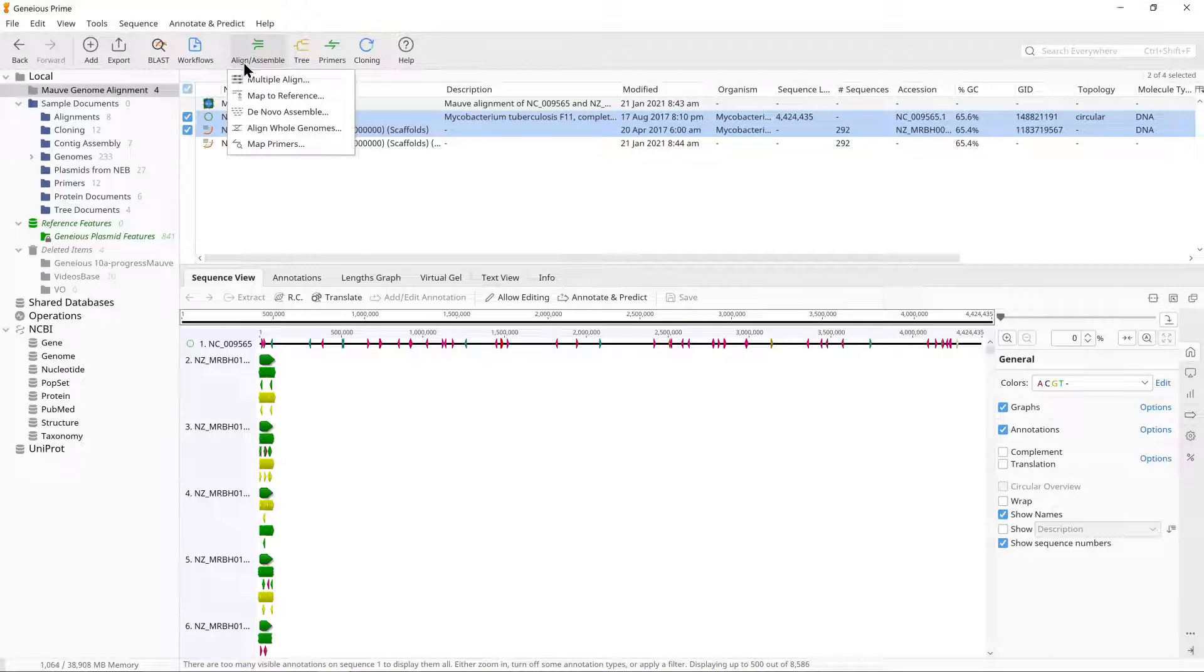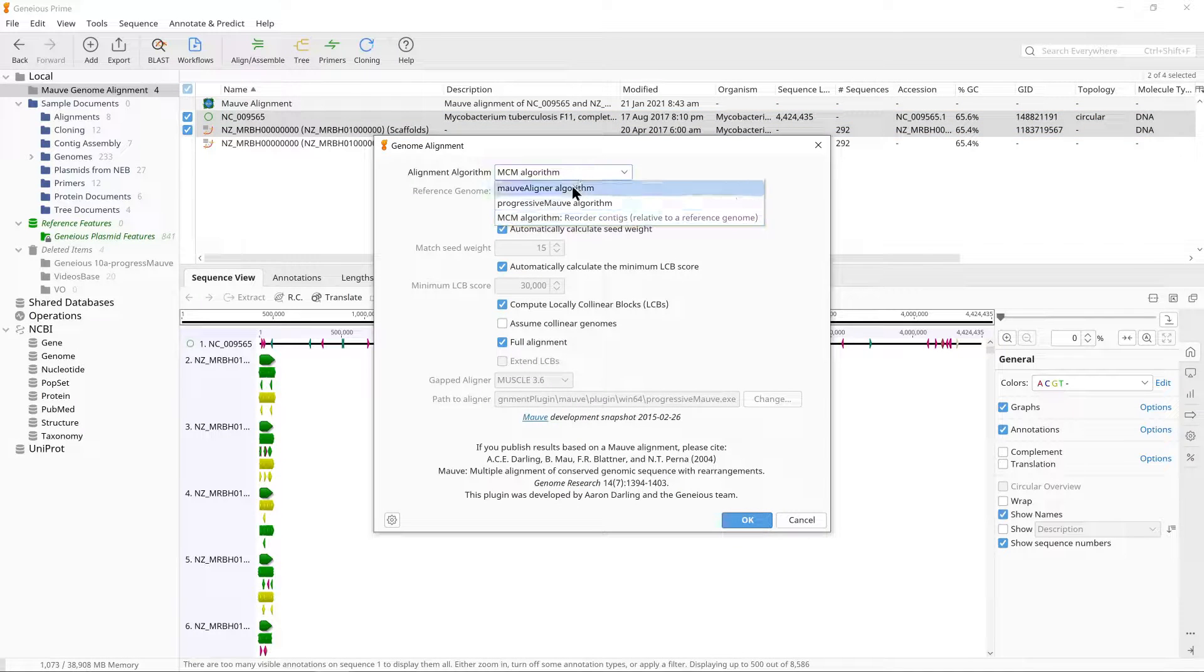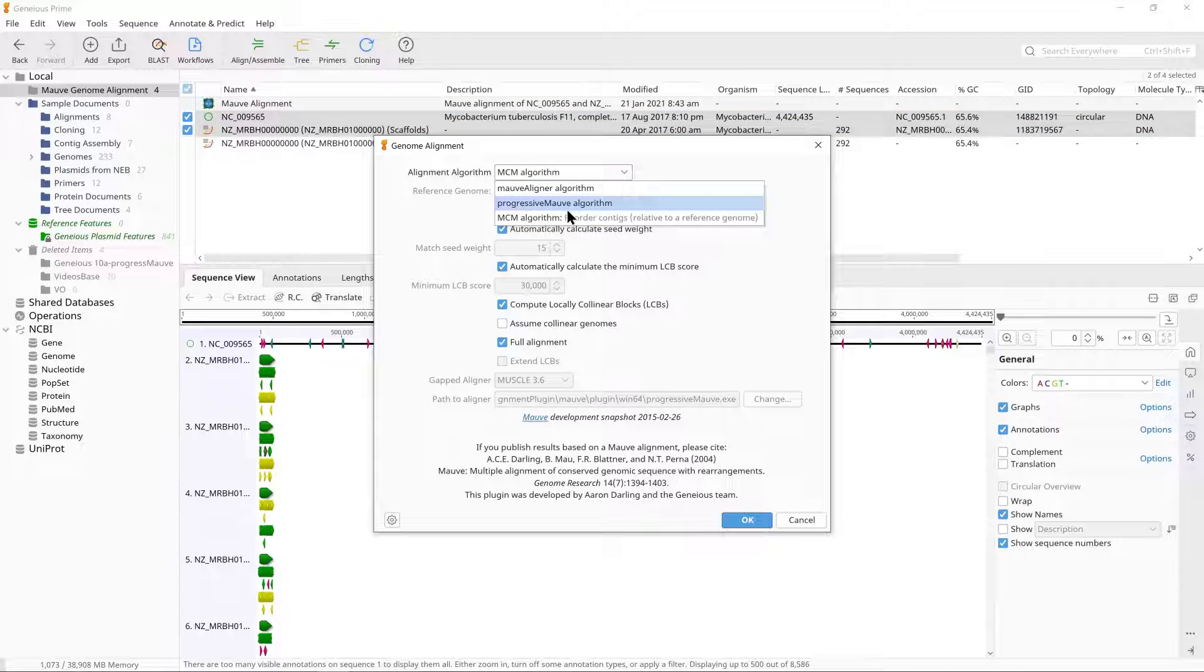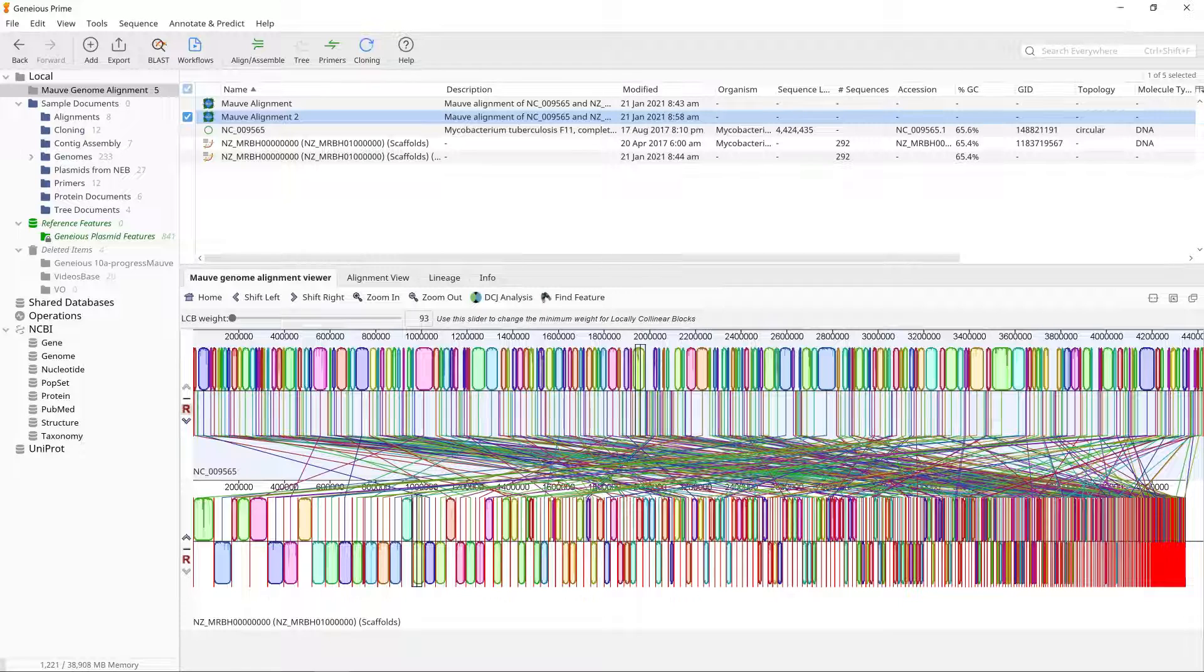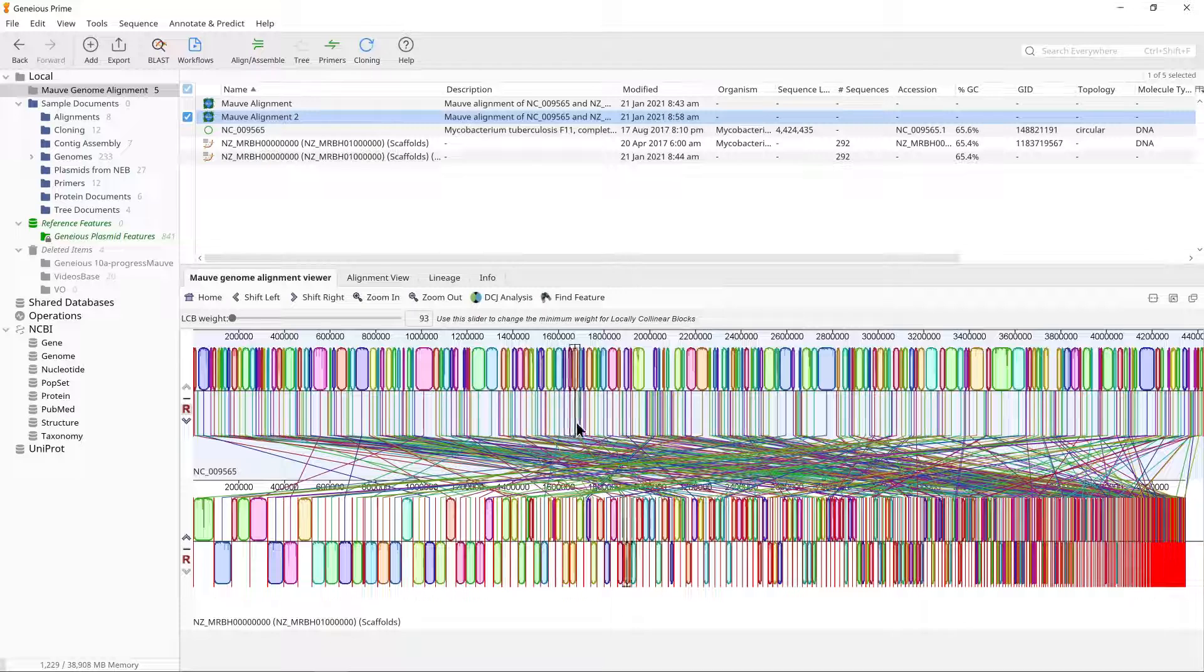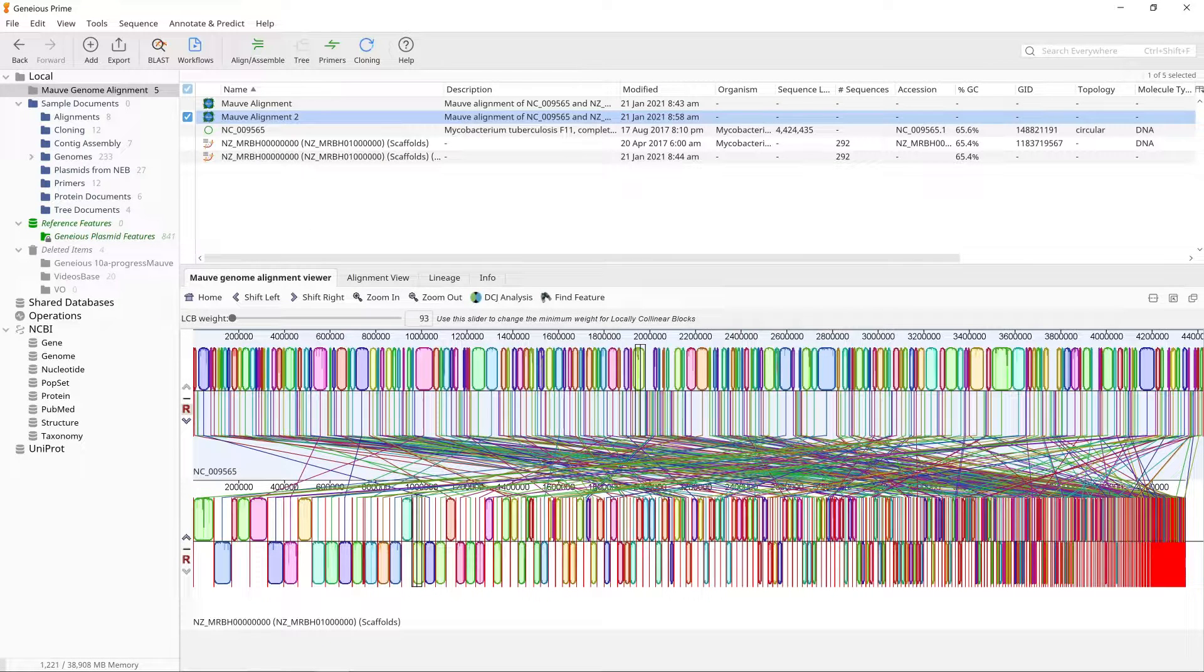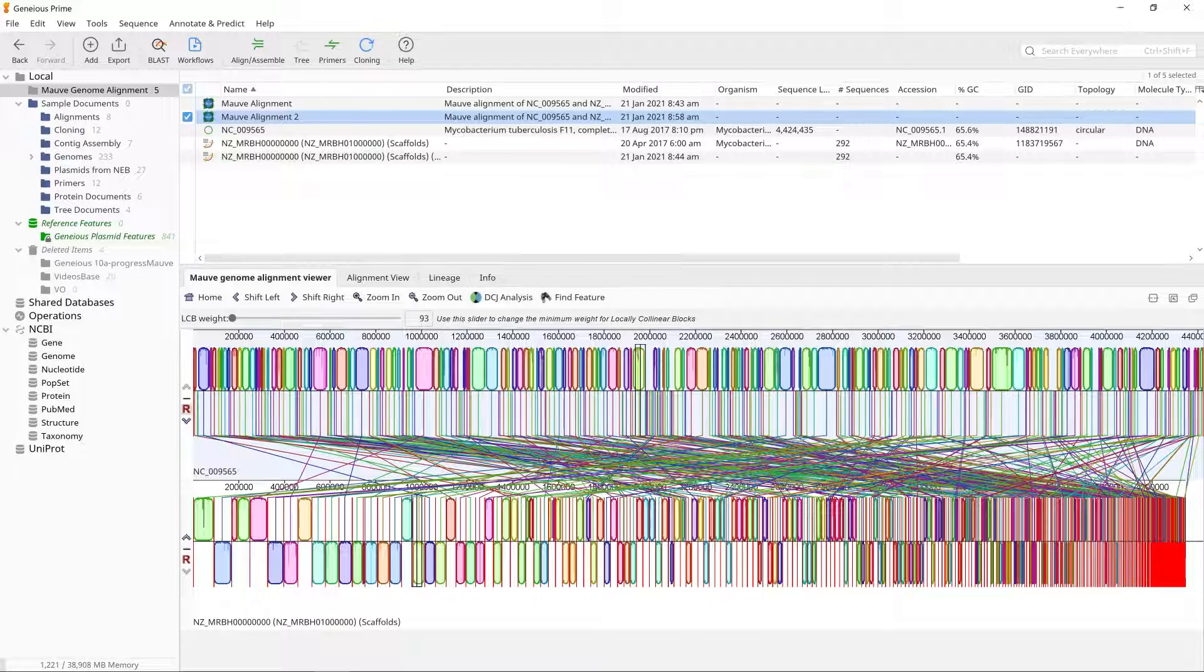Now try repeating the same alignment with the progressive MOV algorithm. You will see that this alignment has many more LCBs and rearrangements than the MCM alignment. This is because when draft genomes are aligned with progressive MOV, Geneious concatenates the contigs into a single sequence in the order they appear in the sequence list prior to performing the alignment.